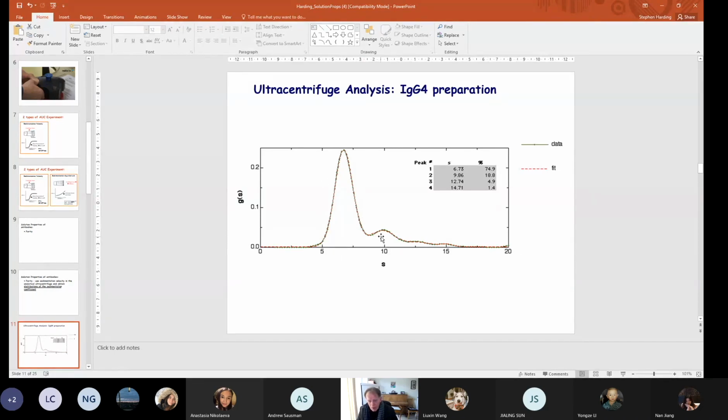But this preparation is an antibody from that particular company, and they sent it to us as part of a PhD studentship of someone who did the MSc with us in applied biotechnology, and then went on to do a PhD with this particular company, paid by this company. And they were interested in the effects of storage, freeze-thaw and long-term storage on the stability of antibodies, and wanted to know how long an antibody would be kept, or how many freeze-thaw cycles you could do before you ended up with aggregation products. And this is a very aggregated sample.